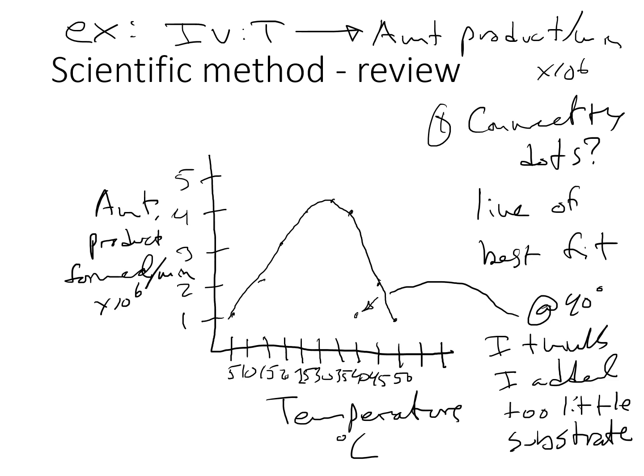This looks like a really nice trend line here. It goes up smoothly, then down smoothly, but if you add in this wonk, then it looks like you are not good at doing this experiment, and so you can't erase it no matter how tempting it is. Last thing on graphs.